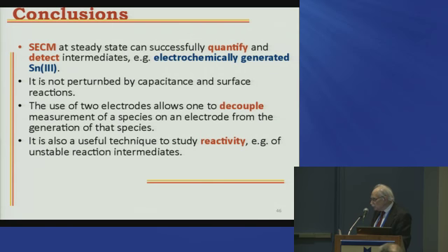In SECM, you're doing this at 2 different electrodes. And so you generate at one electrode, but you find it at the other. And I can kind of independently control these guys, and then they don't cross-talk or cross-couple in this series.